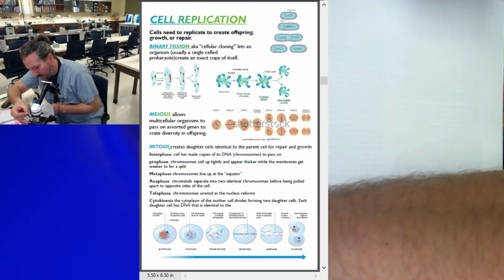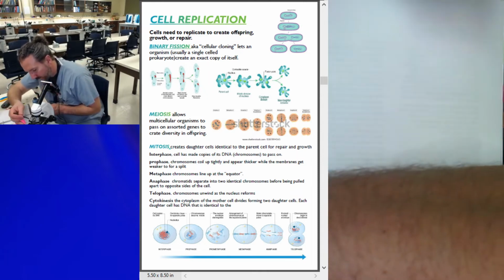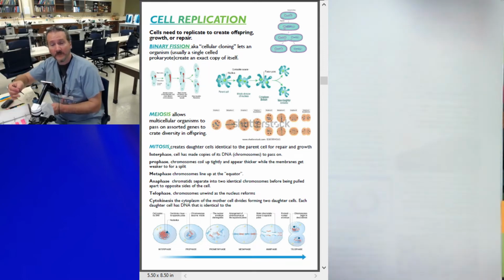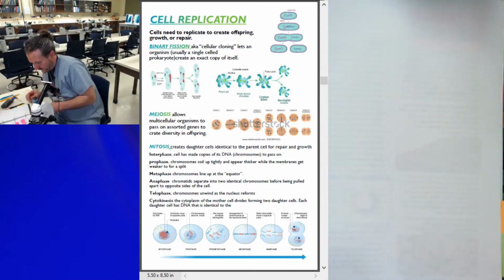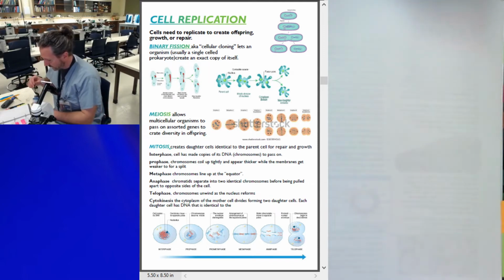Add it to the water. But not quite enough. Oh, and I lost my camera at the same time.